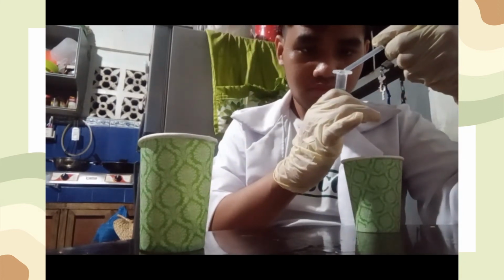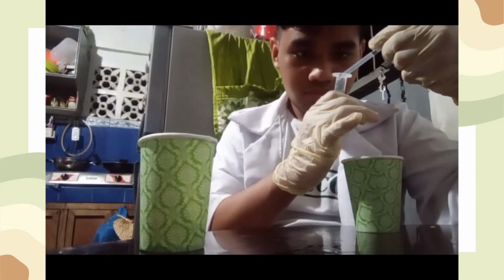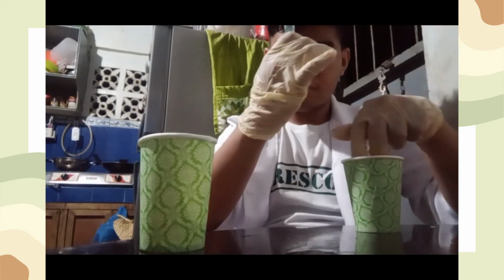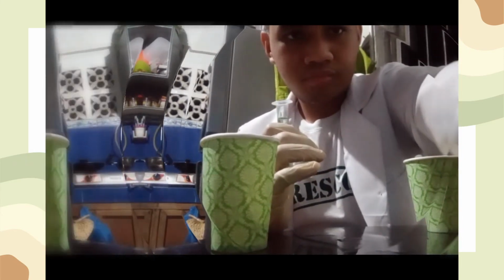And then we're gonna tilt the test tube approximately 45 degrees and add 20 drops of the chilled alcohol so it slides down the test tube without disturbing the solution. Since it's less dense, the alcohol will sit atop the mouthwash and soap solution. And now we're done adding 20 drops of the chilled alcohol into the solution.